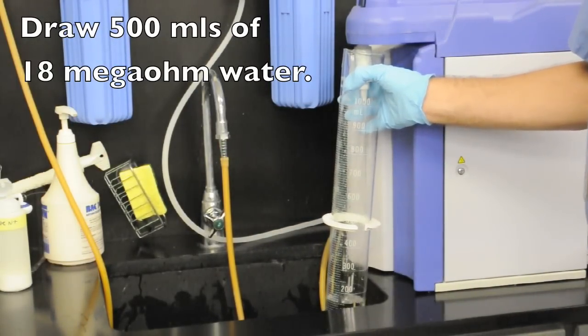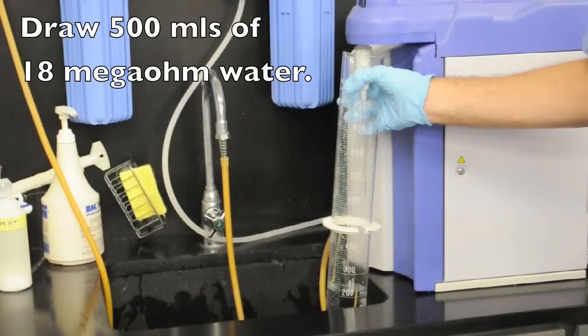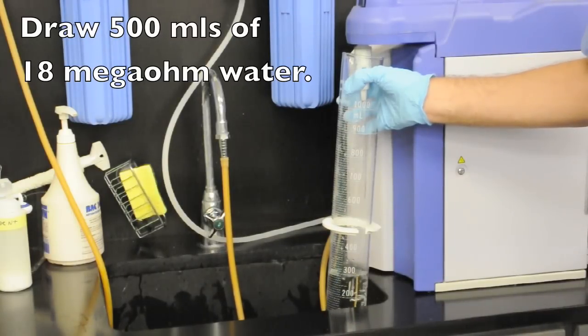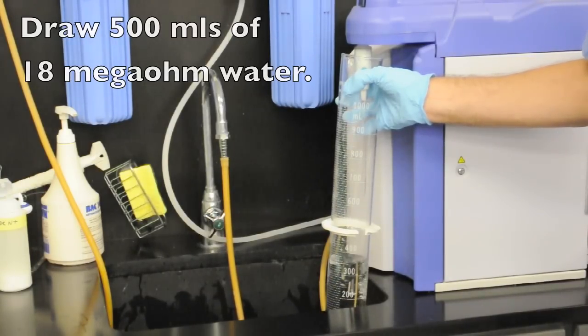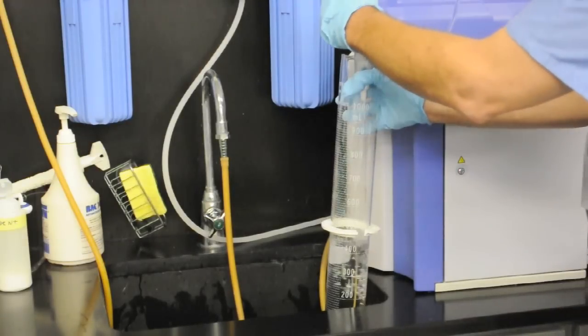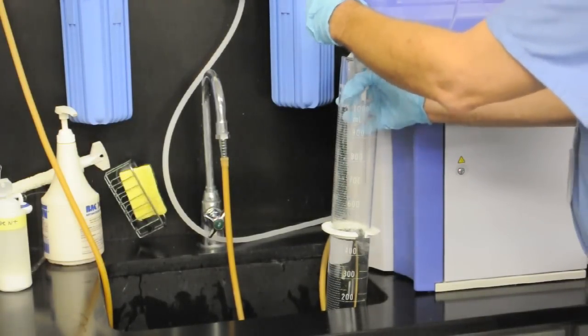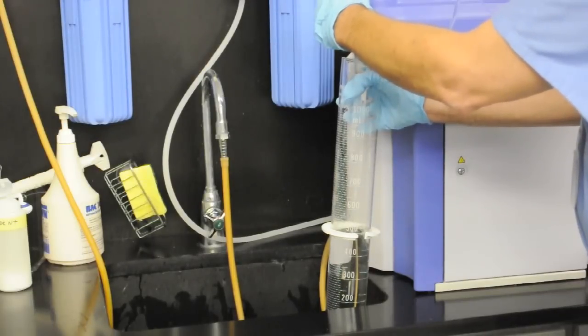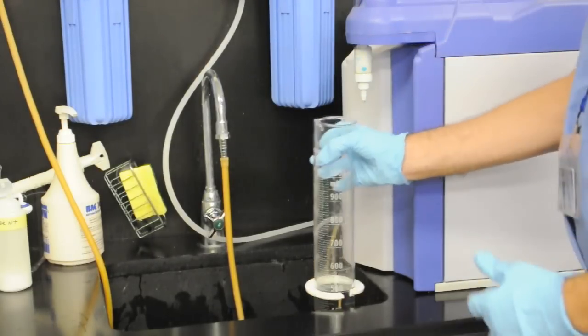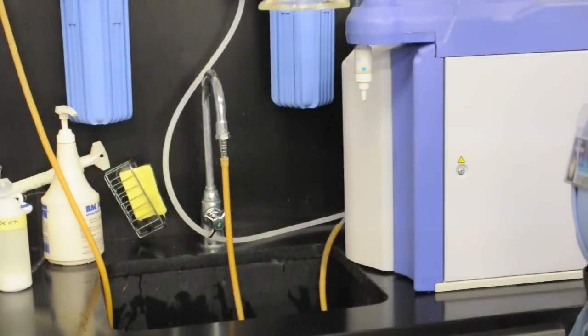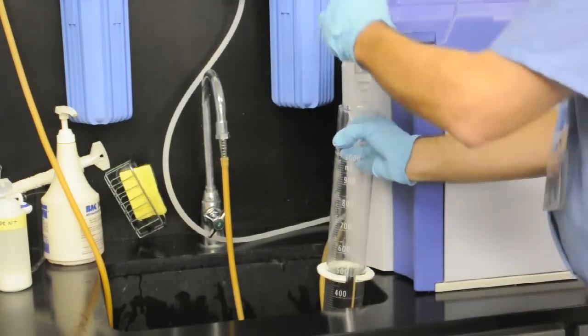The 18 megaohm water source that we use produces highly purified water and it has two positions on the switch, a constant flow and also a pulse flow. So we run it on a constant system until we get nearly to the top and then we use the pulse button to bring the water up exactly.